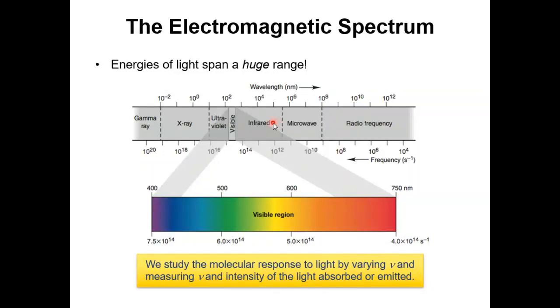For instance, in infrared spectroscopy, we're going to use an infrared beam to interact with our sample. Then we generally look at the absorption spectrum, then try to figure out information about our sample. And in UV-visible spectroscopy, we send a beam of UV or visible light going through our sample. We're also going to see the absorption spectrum and figure out information about our samples.